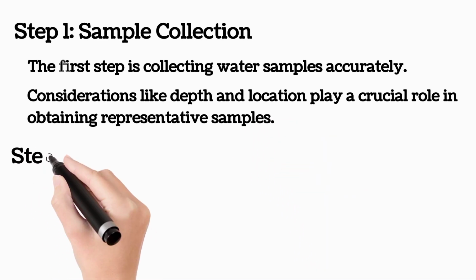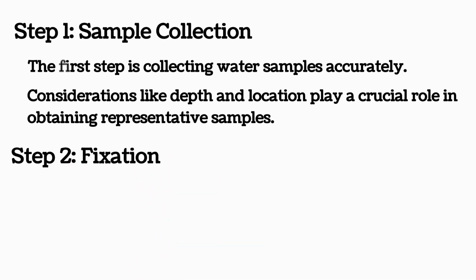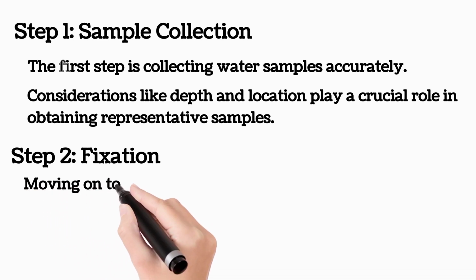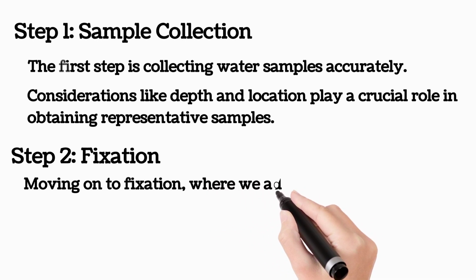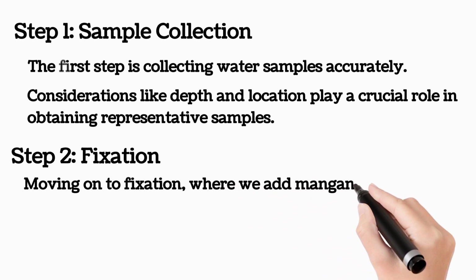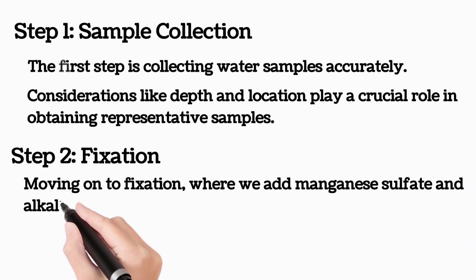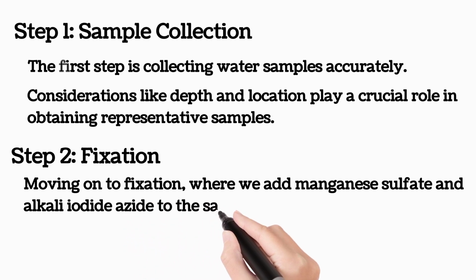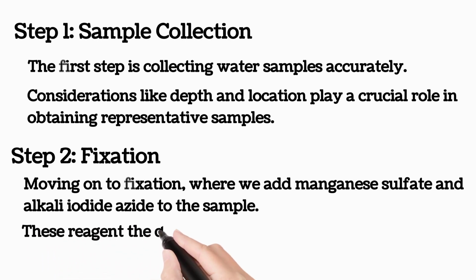Moving on to fixation, where we add manganese sulfate and alkaline iodide azide to the sample. These reagents fix the dissolved oxygen, preparing it for the next step.